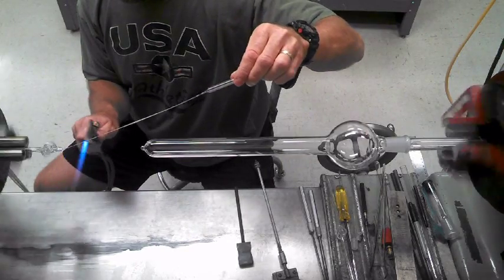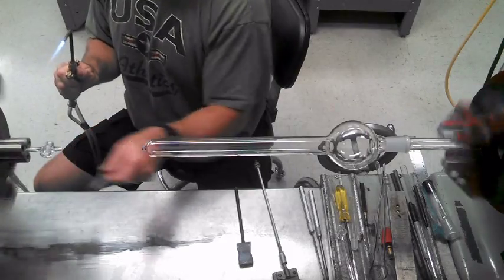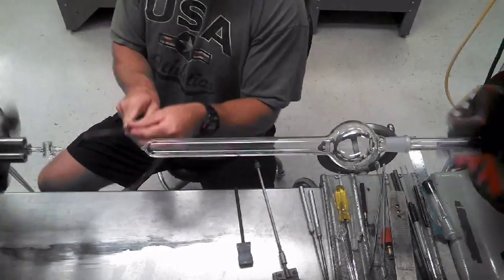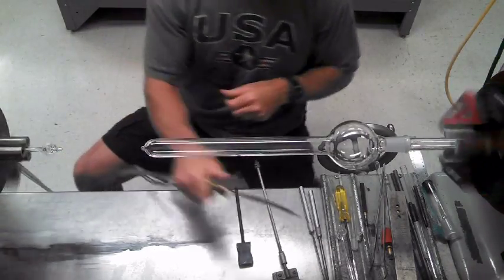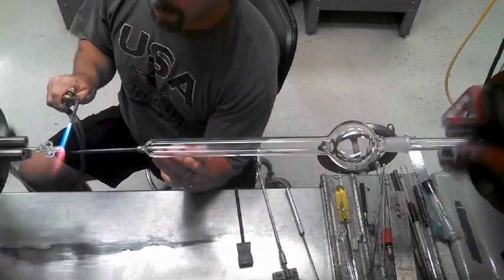Thin off, pool, and cut. Then, like this, break it off. Just a little oxygen — blow it out. Put it in the claret.